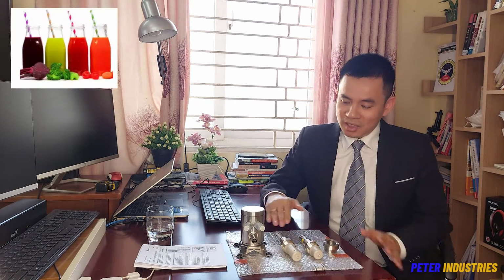We can use a conductivity sensor to recognize the different product phases in production, like orange juice or apple juice or other syrup. If something is wrong, we recognize it and stop the production. If something is wrong and we don't recognize it, then maybe a lot of product has been filled and we have to dispose of it.